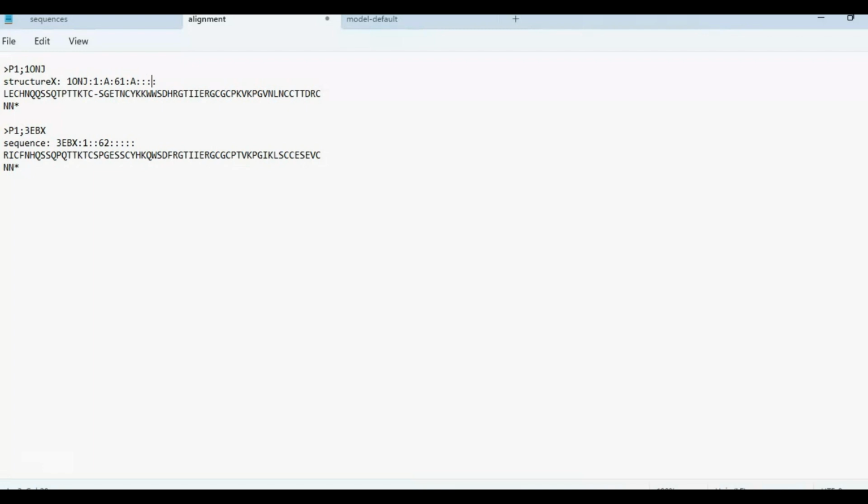And the next field is the resolution of the crystallographic analysis. Let's say that the crystal structure of this protein was obtained at a resolution of 2 angstrom. You can write 2 angstrom there. But again, these fields are optional. The last four fields are optional. And the last field is the R factor of the crystallographic analysis.